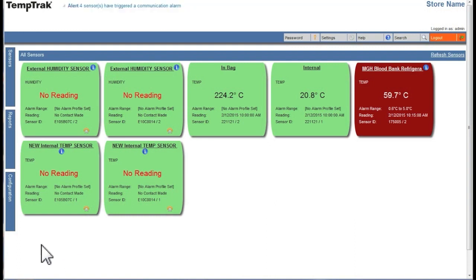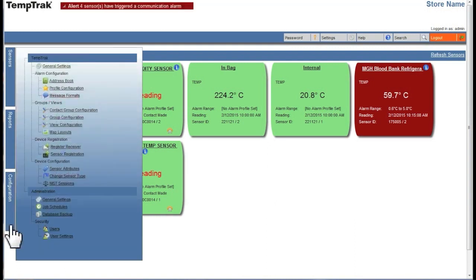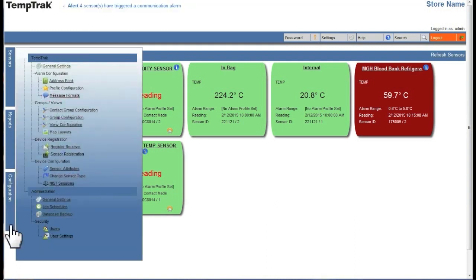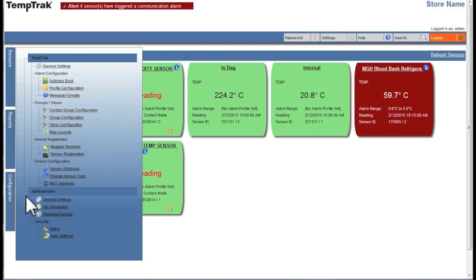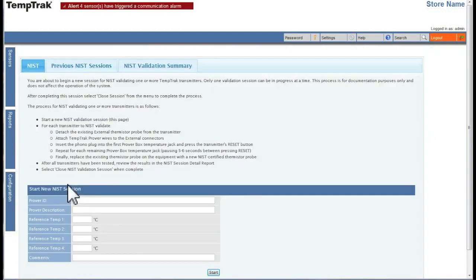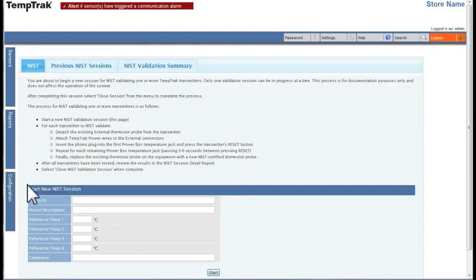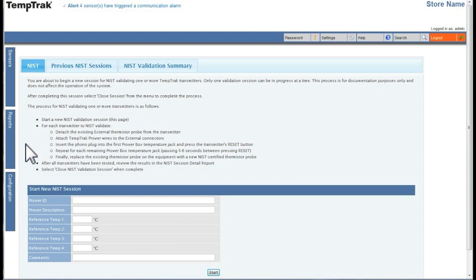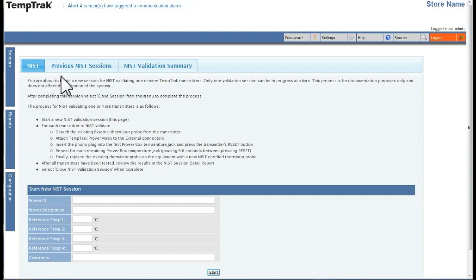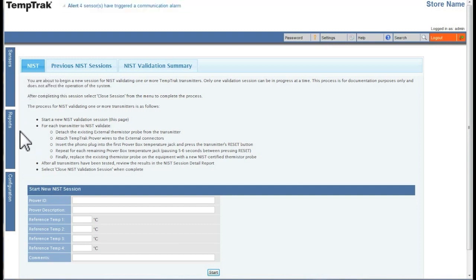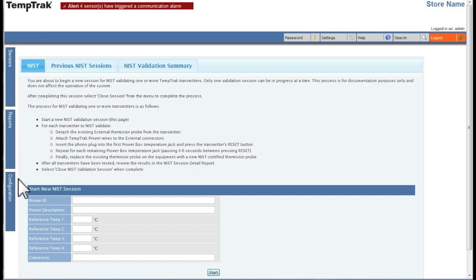To start a NIST session, click on the Configuration tab on the left and then select NIST sessions. On the NIST tab, there are two sections. The top section quickly explains the NIST process and how to validate one or more transmitters.